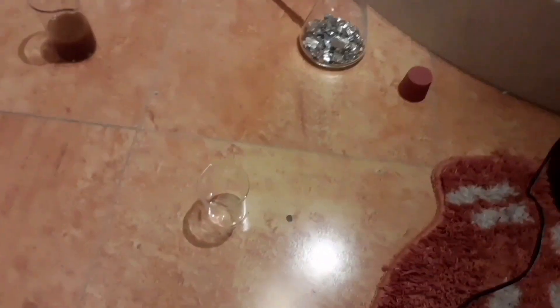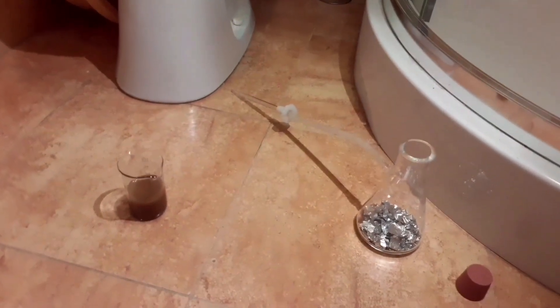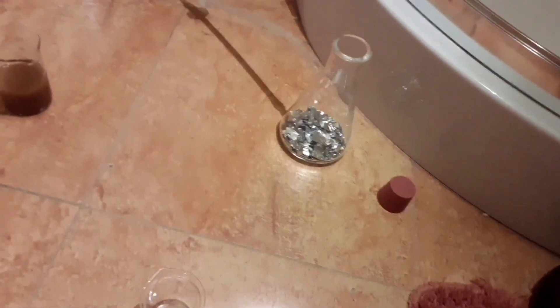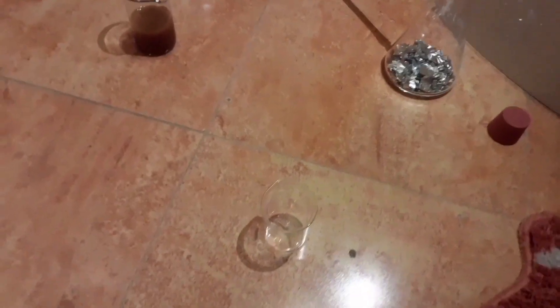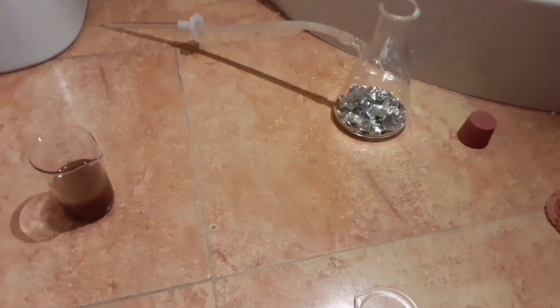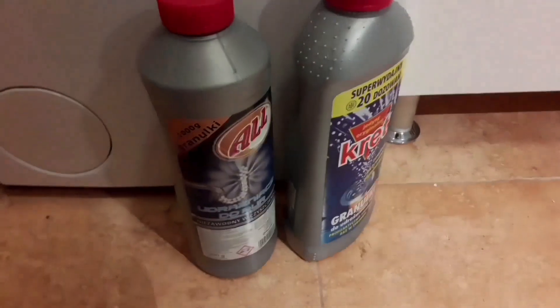Hopefully nobody will interrupt us here. We are going to carry out this experiment in a toilet. I think the basement could be a bit too suspicious, but the toilet is perfect — it just balances weirdness and a certain harmlessness. So we're going to generate some hydrogen gas to reduce our platinum dioxide to platinum black, our desired product. To generate hydrogen gas we need aluminum and some sodium hydroxide.